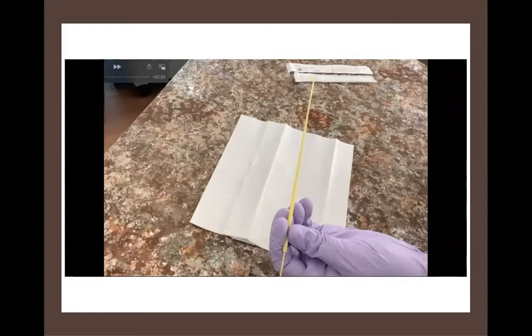It's a problem in all of laboratory work that we use a lot of plastic. We use a lot of single-use plastic disposable materials. And hopefully at some point we will get away from that. But this is a tool that's available to us. And some people really like these because it speeds up their work.